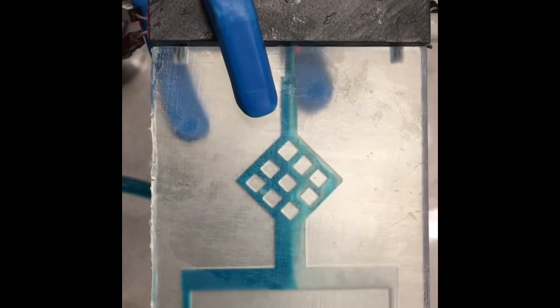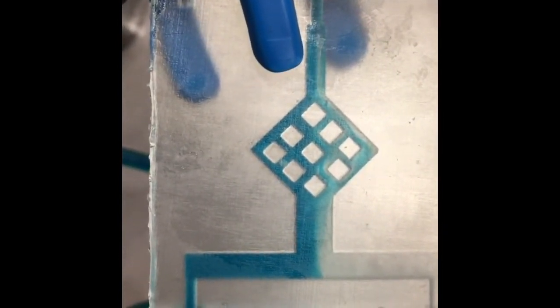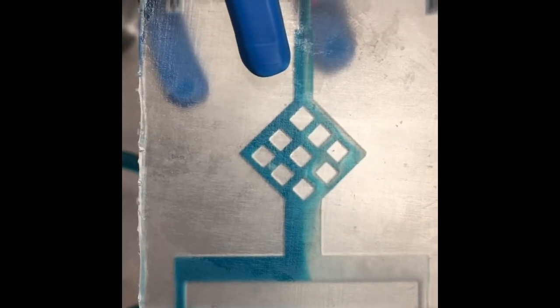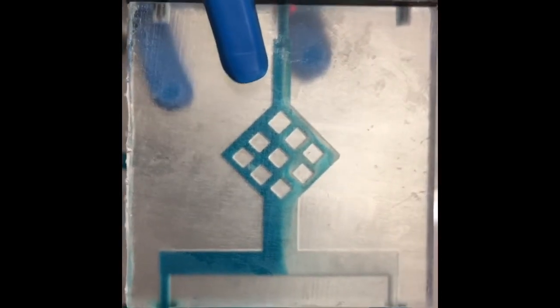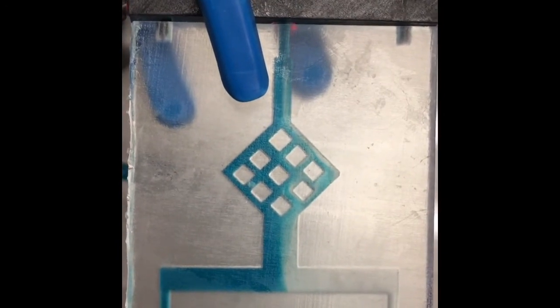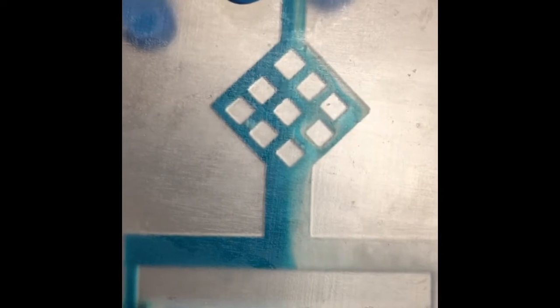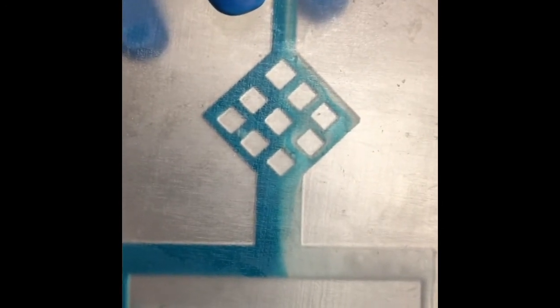The pretzel reactor was our 3rd best reactor. We see a boundary layer form right before the pretzel between the malachite green and the sodium hydroxide. The boundary layer is slightly broken by the first diamond, but not by much. We only see malachite green mix into the sodium hydroxide stream and not the other way around. The boundary layer is still visible at the outlet of the reactor.